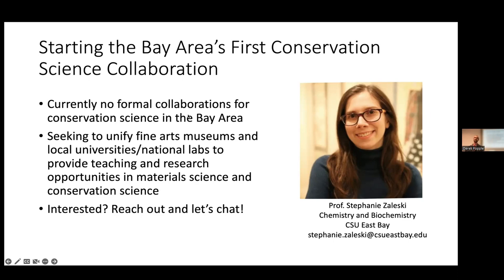With any technique you have to be careful not to over-apply it. People get into their specialty and think it'll be the best technique for everything. It sounds a lot less destructive and a lot more applicable to a broader range of material than XRD, where I had to grind everything up and compress it and all that stuff. So it's a little different.